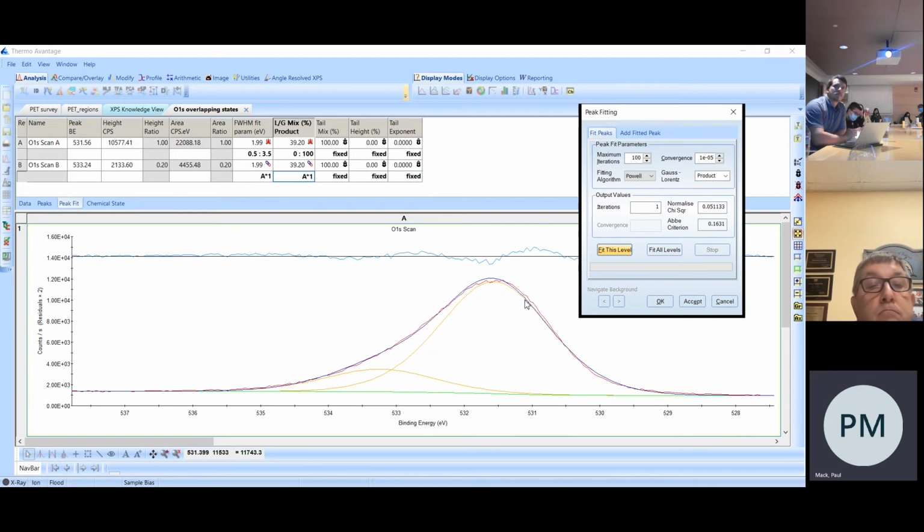But what we see here on the right-hand side, the fit here is not great. So what we want to do now is we could add another component, but then, as I say, adding more and more components, you'll always get a better fit. The best thing to do is, at the moment, we've constrained everything to be the same.